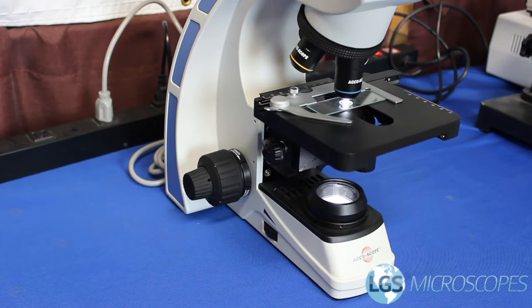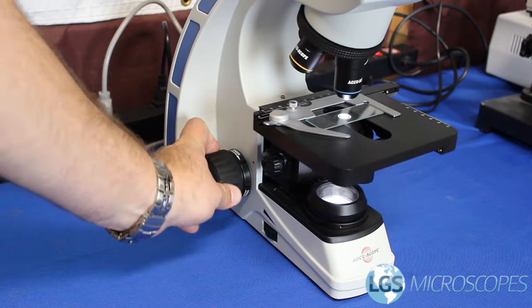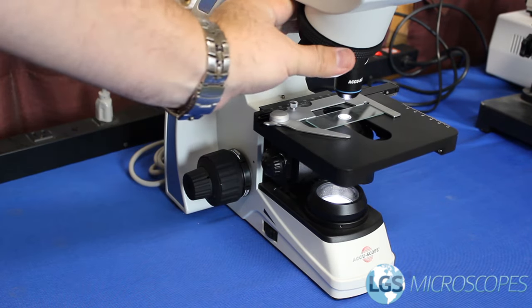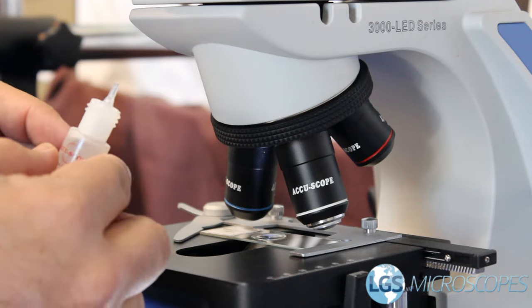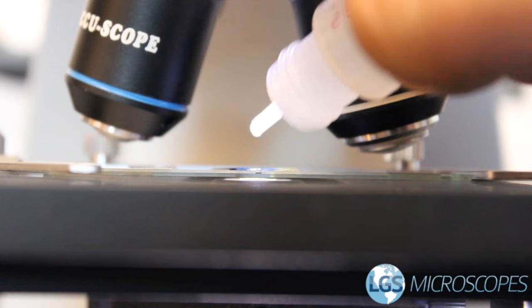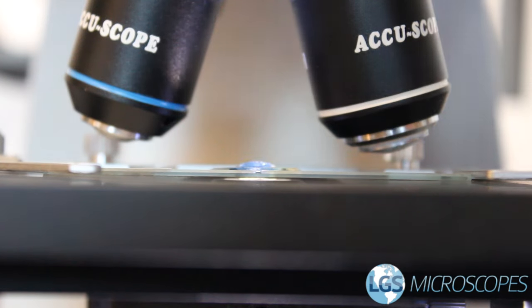When you're completely done looking at your sample under the 4x, 10x and 40x objectives, go ahead and lower your stage then move the objectives to where they're right in between the 40x and 100x objectives. Then you can add your immersion oil, just one generous drop.